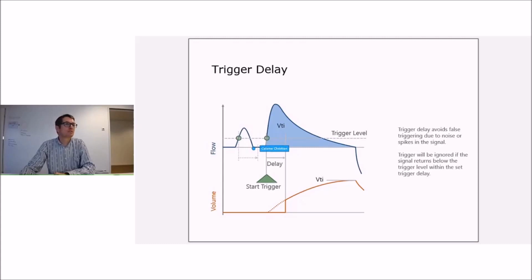So this was a no trigger thanks to the trigger delay. Now here the signal goes up and stays up even for the delay time. And then the whole integration keeps going and keeps going. Now, of course, and we can see that here, we do not miss any of the signal. So it already started the integration because it doesn't want to miss anything.